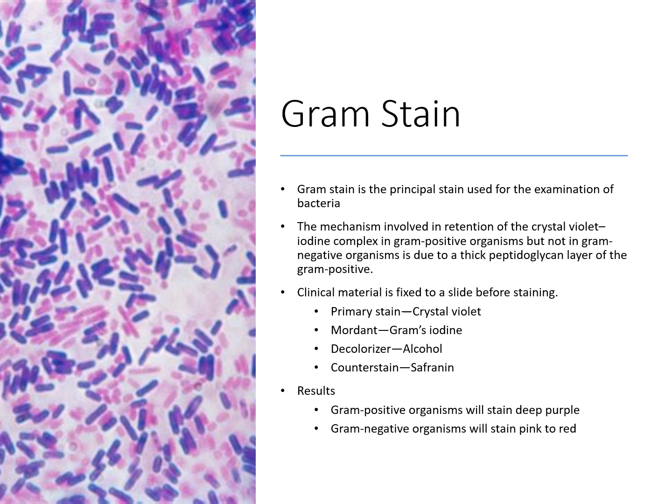With a gram stain, this is the most used stain within the laboratory for viewing and differentiating bacteria.